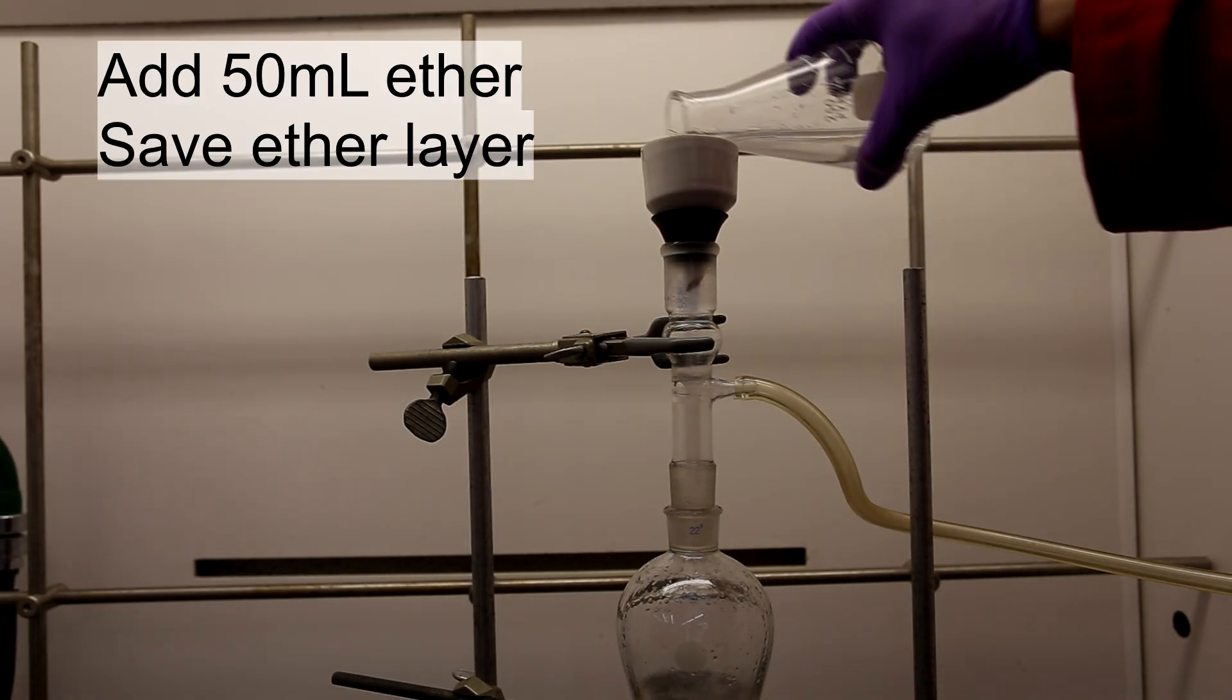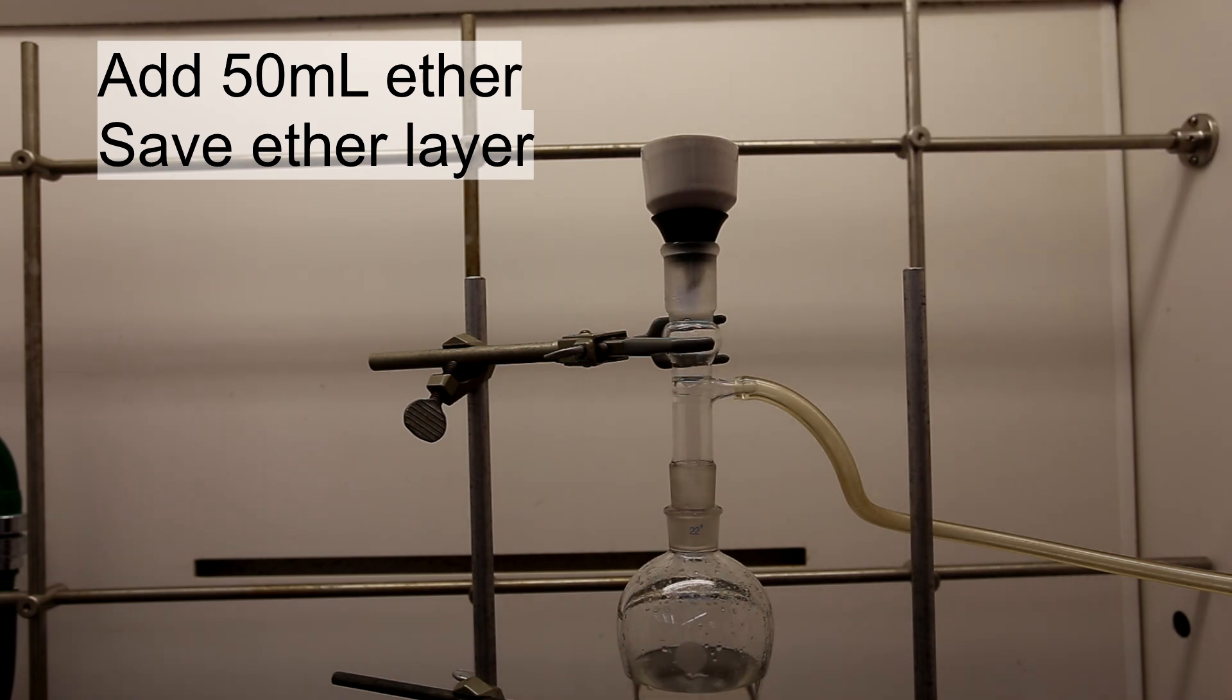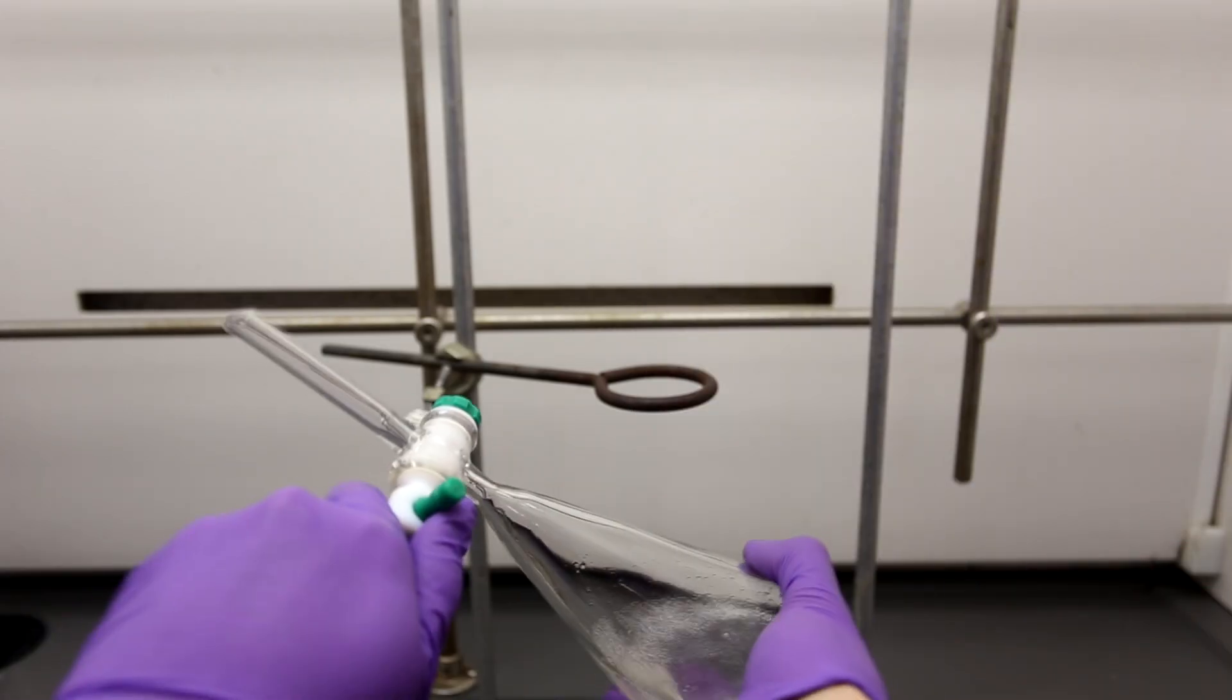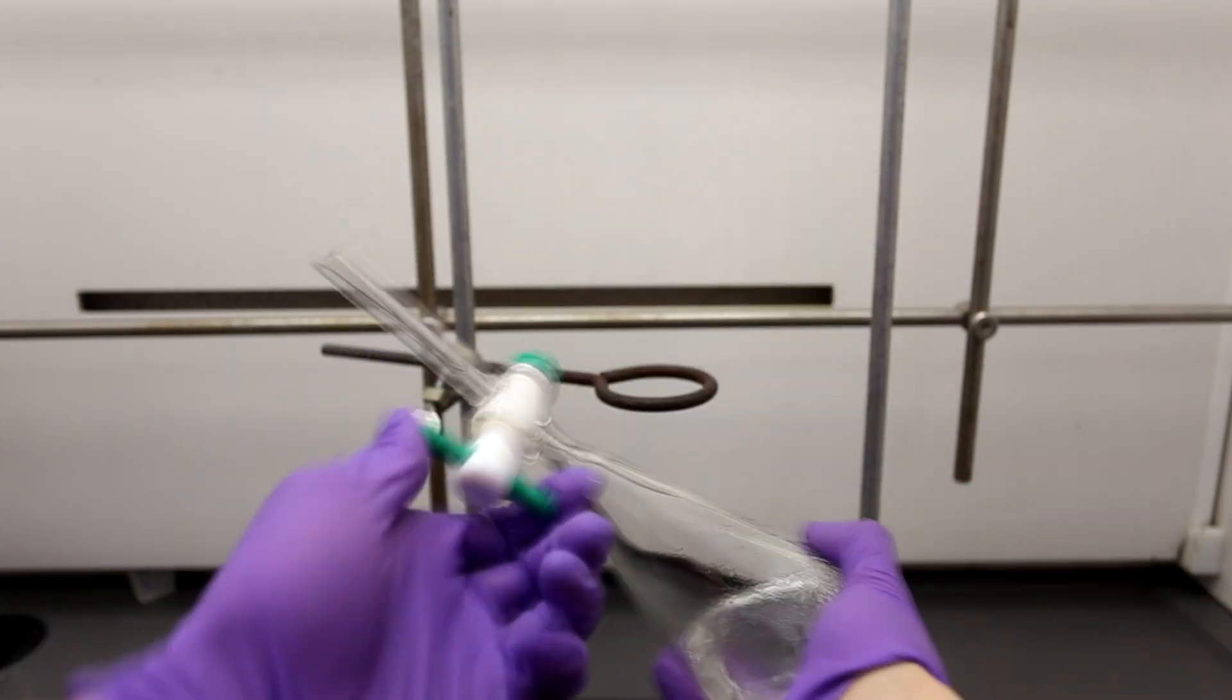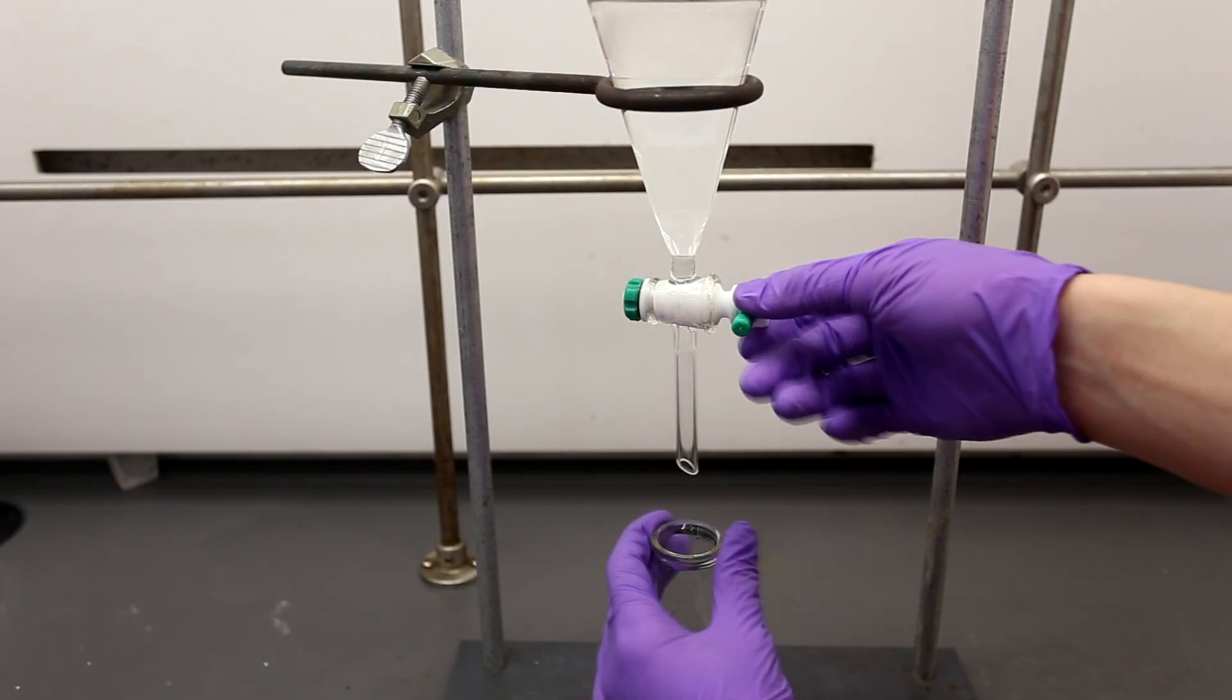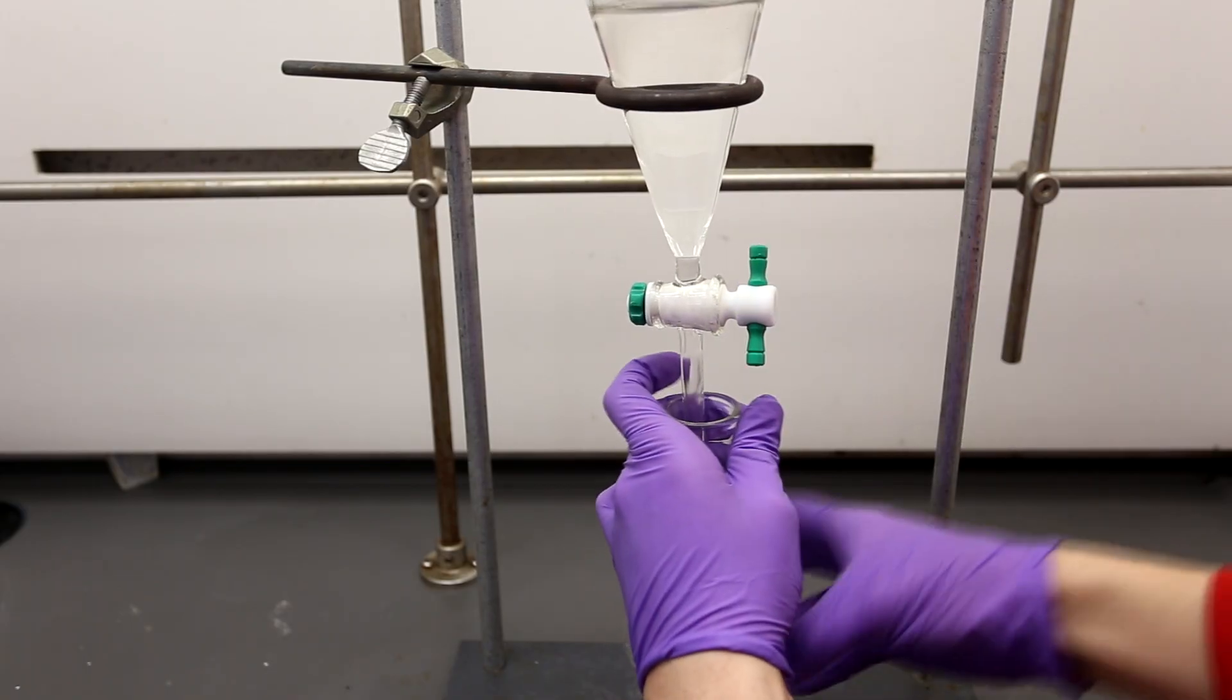The vacuum filtration apparatus was then washed with 50 milliliters of ether. The solution was mixed thoroughly with frequent venting. The lower aqueous layer was drained and discarded, and the ether layer was maintained.